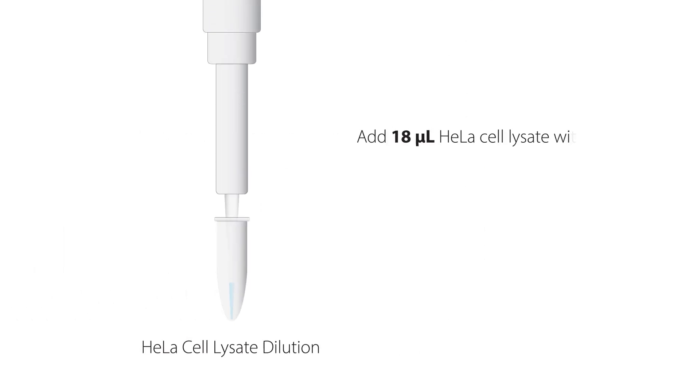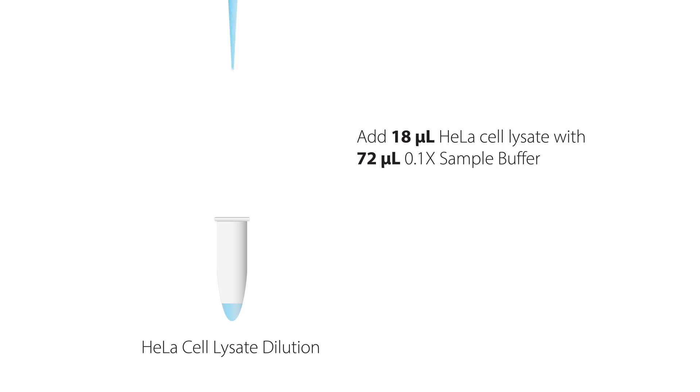Add 18 microliters of HeLa cell lysate with 72 microliters of 0.1x sample buffer.